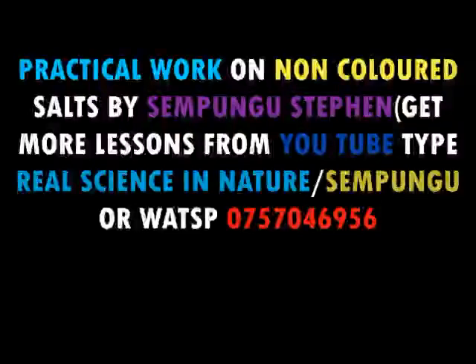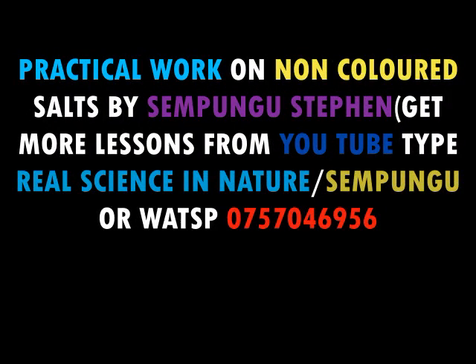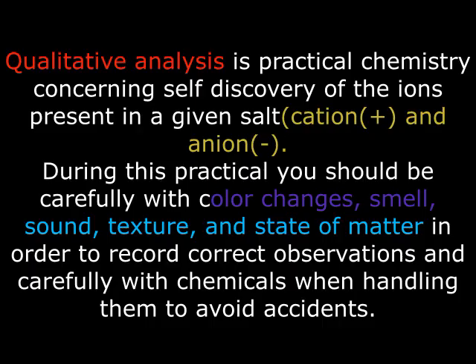Members, today we are back in chemistry, and our chemistry is mainly practical. So remember, practical, your teacher told you that it is subdivided into two. We have what we are calling quantitative analysis as well as qualitative analysis. So today my idea is going to be on what we call qualitative analysis.